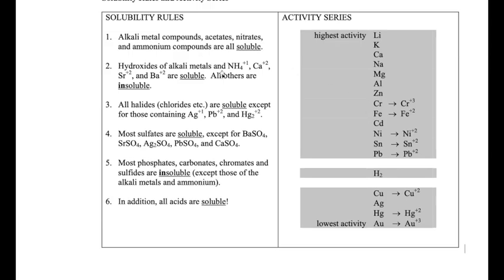All right, so that's the reactions pre-lab, and now I'm going to show you an example of how to complete your reactions pre-lab with one reaction example.